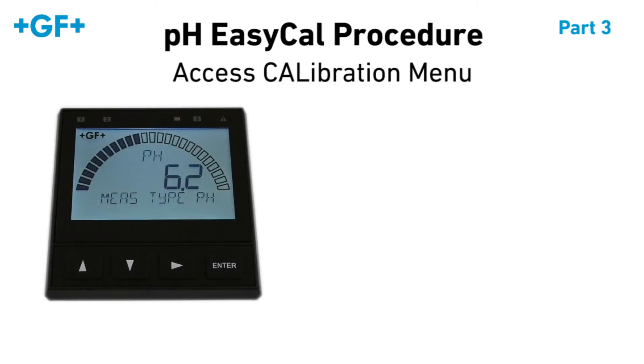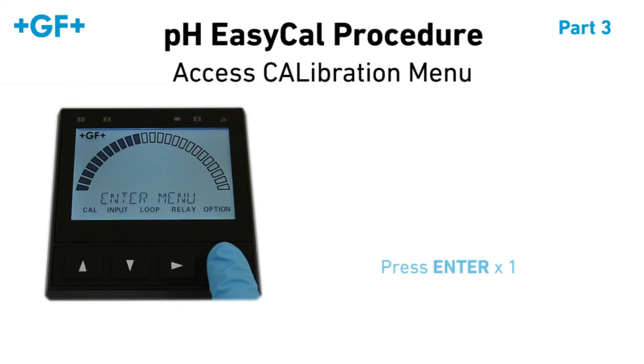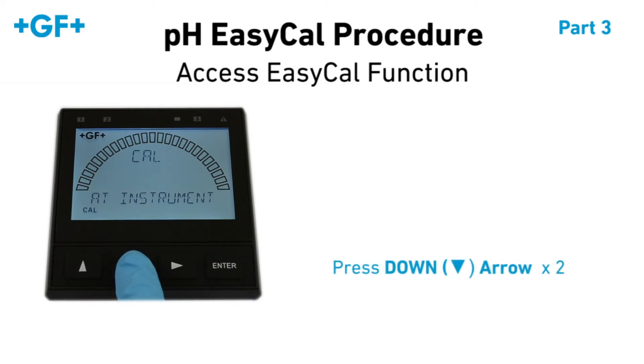pH EasyCal procedure. First, we have to access the calibration menu. On the 9900, press and hold the Enter button for five seconds. Navigate to the Cal menu and press Enter. The first setting shown must be set to Cal at Instrument. Press the down arrow twice.